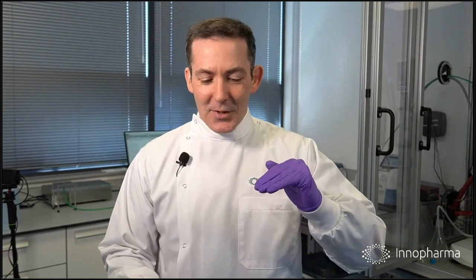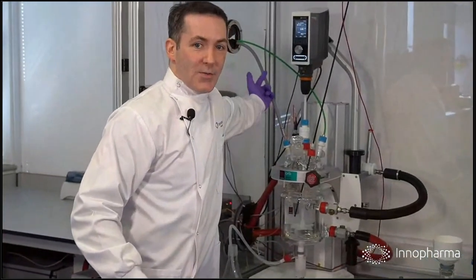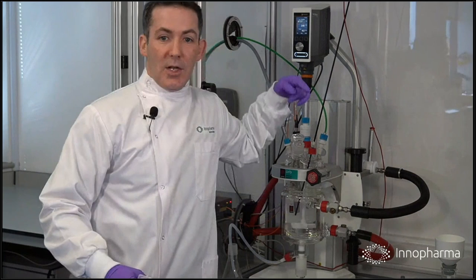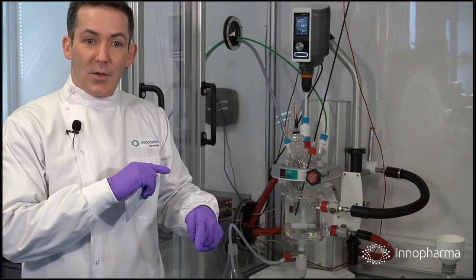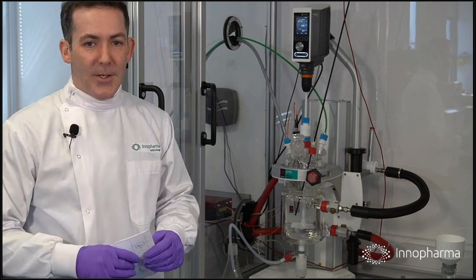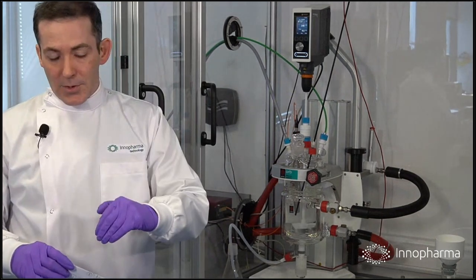But in fact, what I should say is that the detection is happening just by delivering light and capturing the light. So rather than extracting a sample from the process, measuring it and returning it to the process, that's why we have our probes directly positioned in the process. I'll show you again these probes here. This probe is seeing directly inside the process. It has fiber optic cables that are directed right into the reaction vessel itself. So light is delivered into and then collected from the solution. We'll talk about how that's converted so we get actual light signals from the solution. Similarly, with our Raman spectroscopy instrument, laser light is being delivered to the solution and collected.